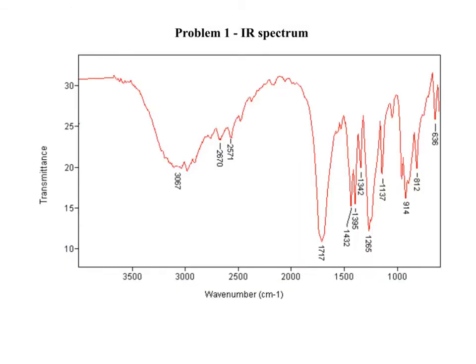In the lab, an infrared light is used to interfere with bonds between certain molecules, which causes them to essentially dance, as Professor Zaba would say. So the motion and the vibrations of the stretching of the bonds are tracked on this graph, which is where this comes from. Over time, certain bonds between molecules have been recognized, and the shape of them has been recorded. So I referred to a data table from UC Davis that tracked the 5 zones of an IR spectrum.